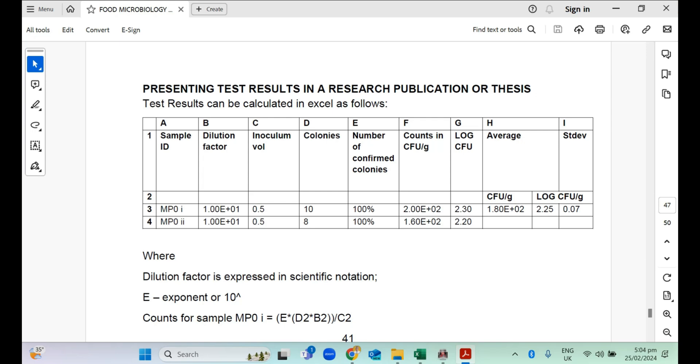Presenting your test results in a research publication or thesis. In microbiology, your data for numerical studies where you have to count microorganisms on a plate, you're going to have colony counts and you are going to dilute the sample. You would want to also find the average of the counts for the various replications as well as the standard deviation.